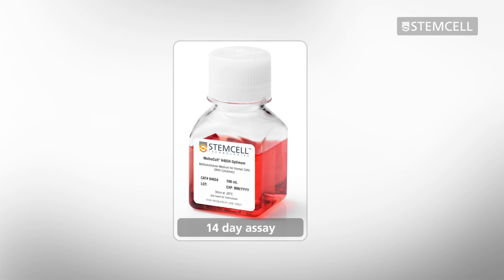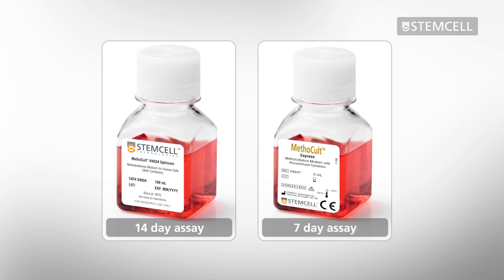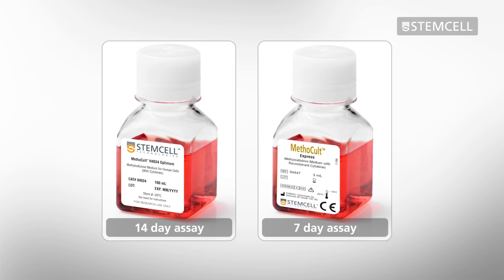It is important to deplete the contaminating RBCs when performing the 14-day CFU assay using Methocult and the 7-day CFU assay using Methocult Express.